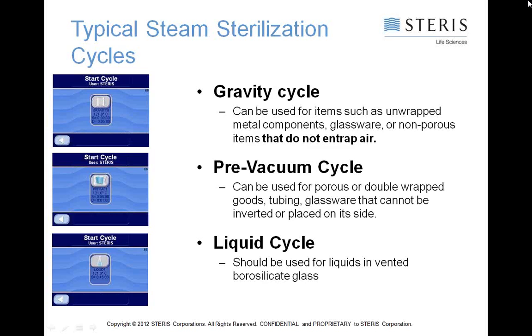I want to turn it over to Adam, because you can do all that and be very successful in making sure that your loads are packed right and that you programmed your autoclave with the correct time and temperature. But at some point, you really do want to step back and make sure that your autoclave cycles are performing the way they need to. So Adam, why don't you take it from here?